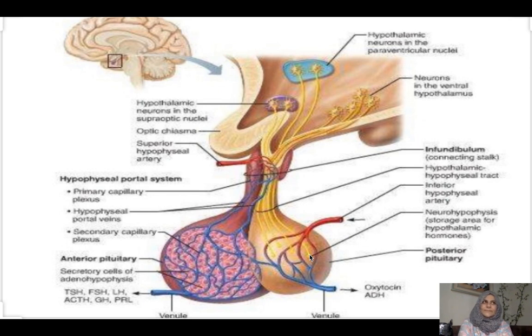يعني من تيجي على pars nervosa characteristic feature of it is Hering's bodies slightly يعني colored وموجودة تعتبر the dilated axons. طبعا these will carry from these two nuclei they will carry يعني in order to initiate الcells مال pars nervosa راح نسميها pituicytes. The pituicytes، they are neuroglial like cells. تذكر بالneuroglial cells اللي هي supporting cells فهنا راح يسموها the pituicytes which are supporting cells represents a large population يعني تقريبا 25% من البوستيريور بيتيوتري جلاند هو بيتيوتوسايتس.